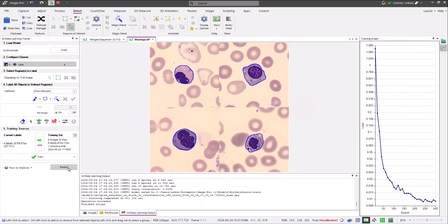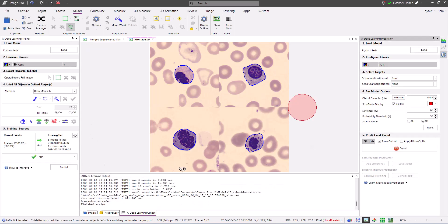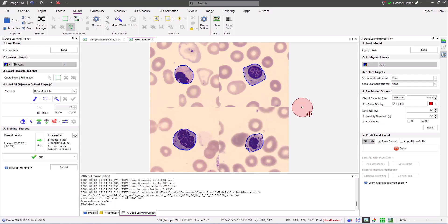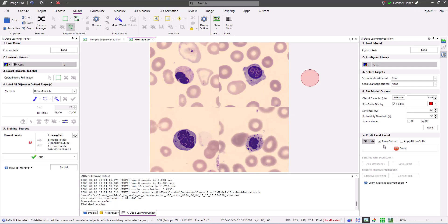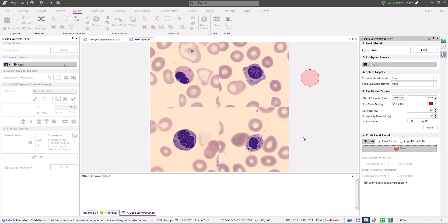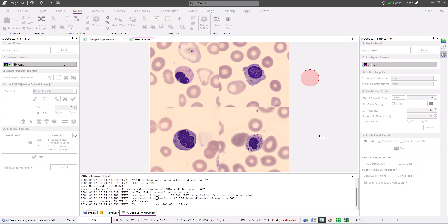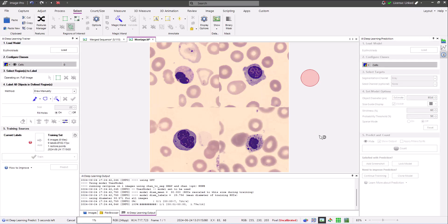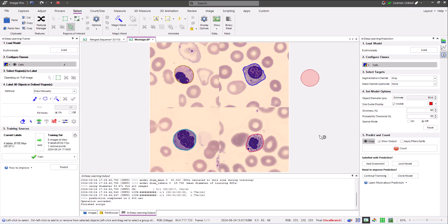Here I'm clicking the predict button in the training panel to open the newly trained model in the prediction panel, and testing the model. The results are impressive, as the model is clearly able to distinguish erythroblasts from red blood cells.